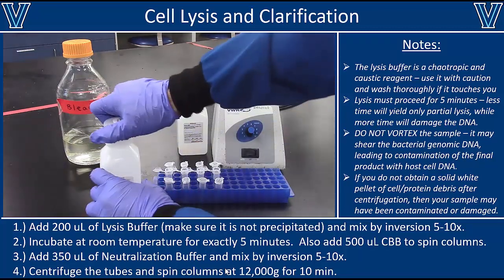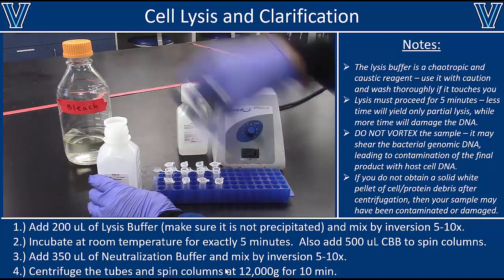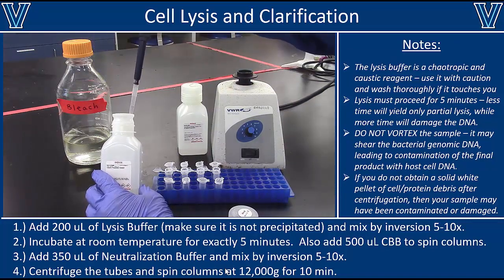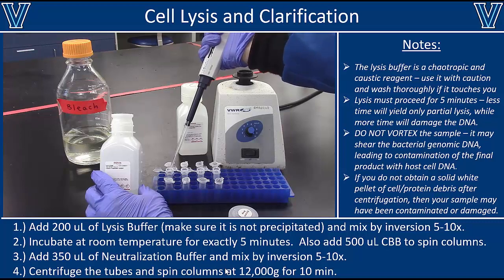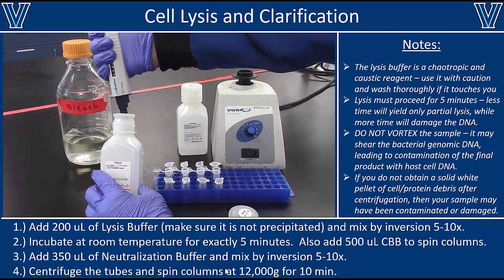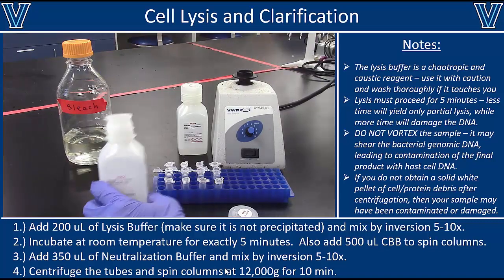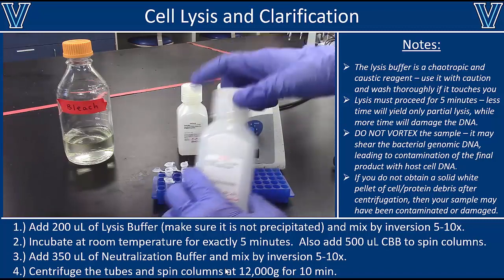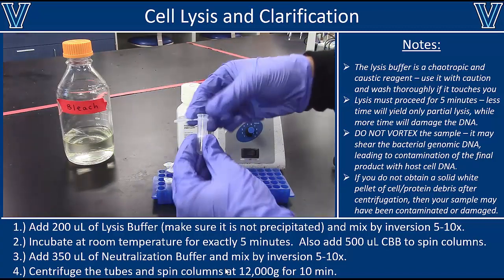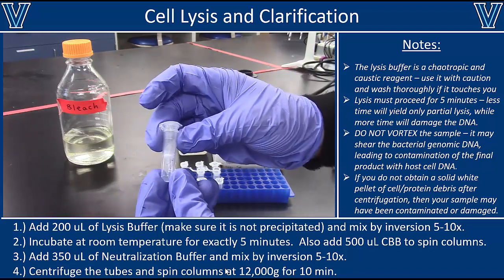While those samples are incubating, if you have time, you can start preparing the spin columns for purification by adding 500 microliters of column prep solution to each of those spin columns. So what this is going to do is wet the resin and pretty much get it ready to bind the plasmid DNA. And you can just let that sit there. You can try to close the caps, but honestly, a lot of times the caps just pop open, so don't worry too much about keeping these caps closed.